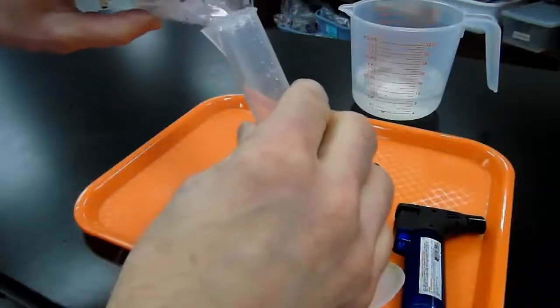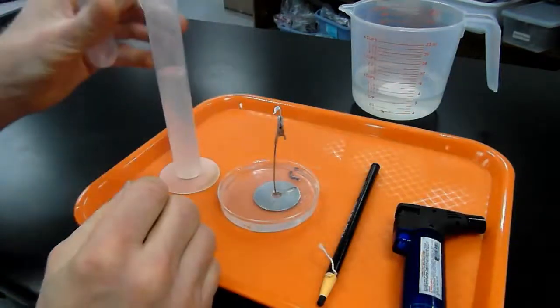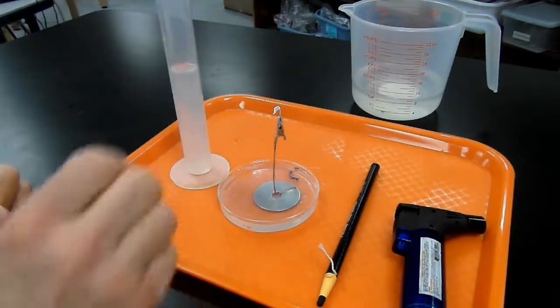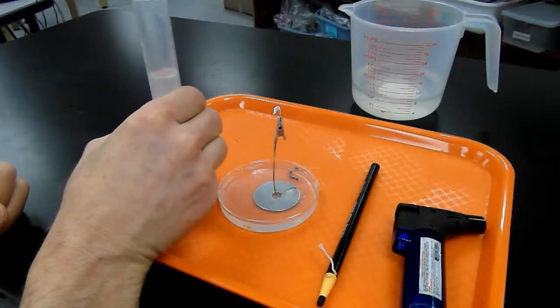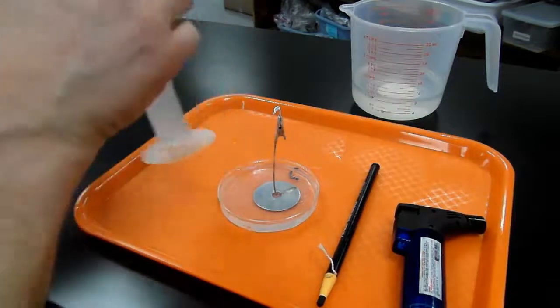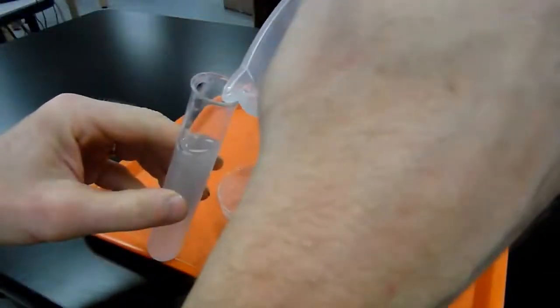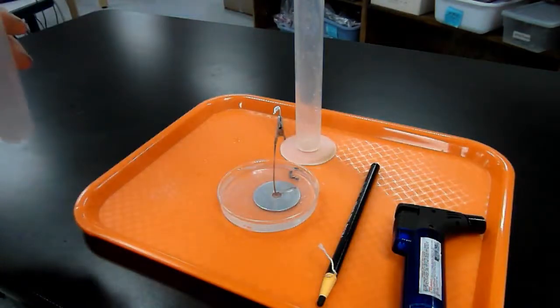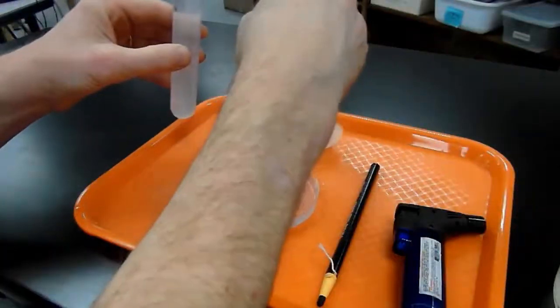So I filled the test tube up to my China marker. And that is a volume of, read here, these are terrible graduated cylinders to read, 42 milliliters. And then we need to measure the volume of the entire test tube. That's going to be a two-step process because the test tube is a little more than 50 milliliters, but that's okay. We can do it in 2 steps. All right, so pour that in.